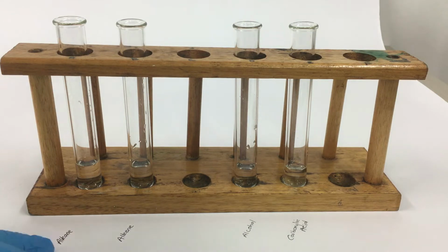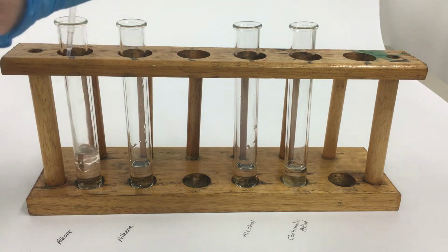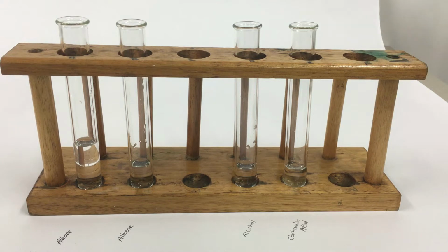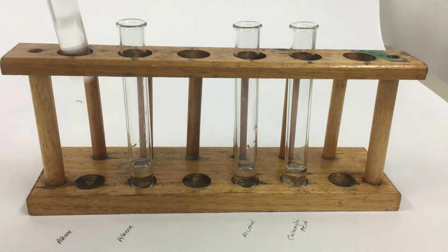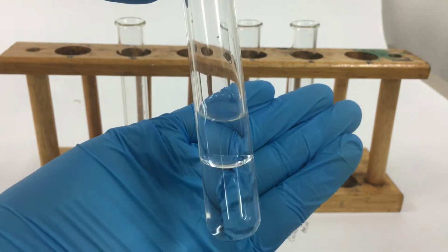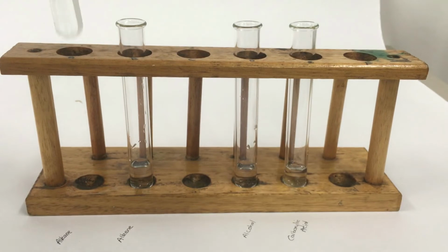So first up is an alkane. This is cyclohexane. Hopefully be able to see this one come down. I'll bring that up close to the camera as well afterwards. So we're getting quite a distinct separate layer. Might be a bit easier there. So the alkane's definitely sitting on top of the water there as distinct layers.